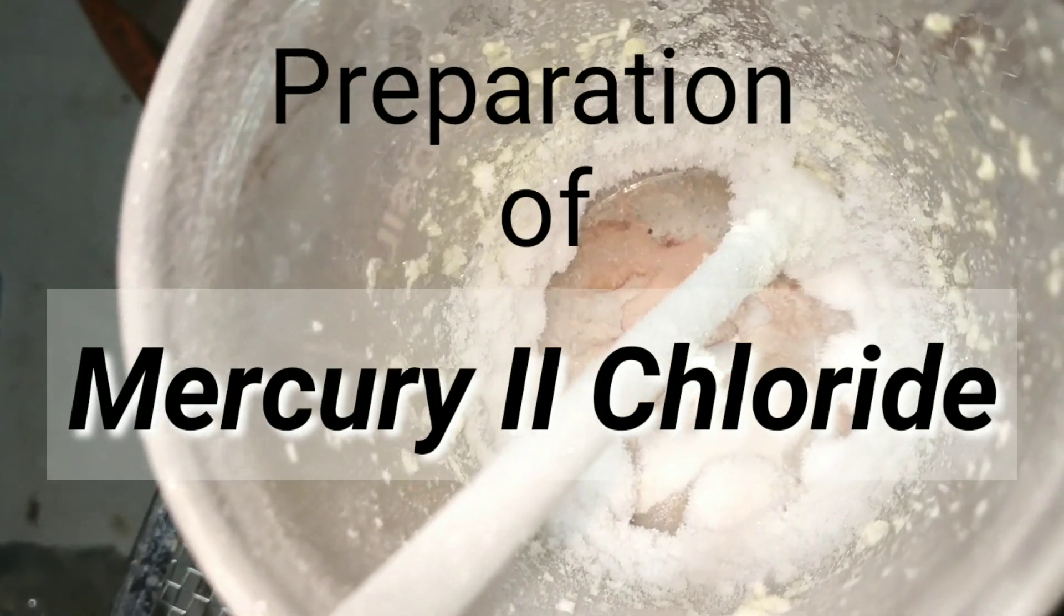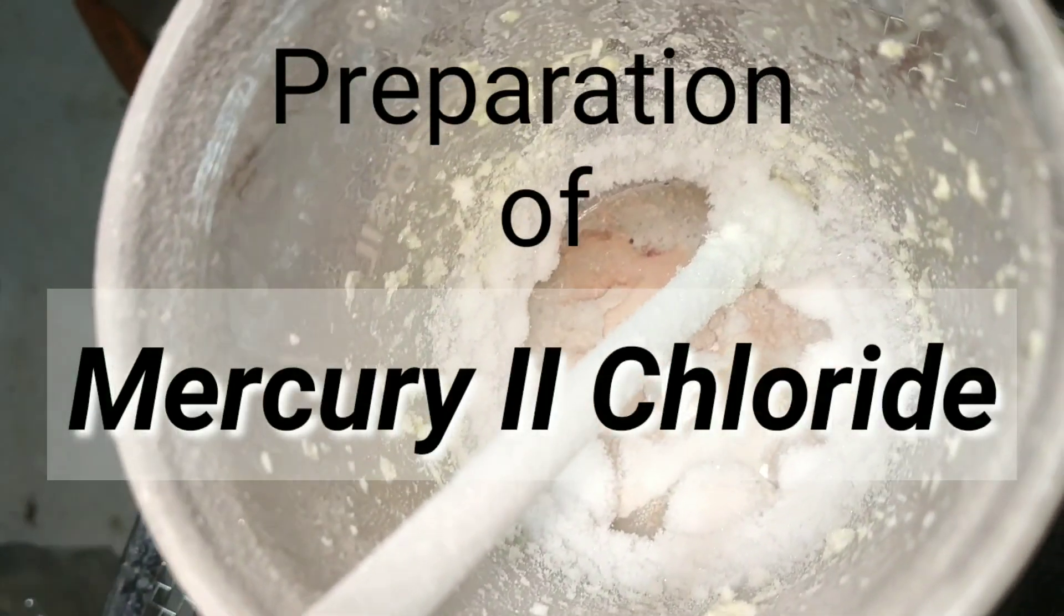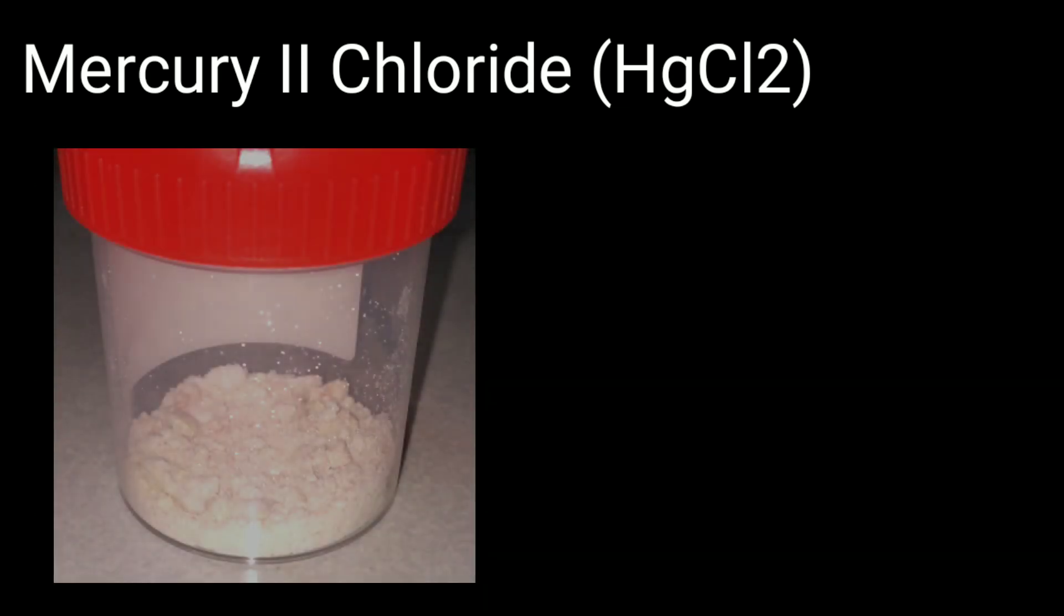Friends, today we will be making mercury chloride from mercury metal. Mercury chloride, also known as corrosive sublimate due to its tendency to sublime at higher temperatures, is an extremely toxic mercury compound which is also a very useful laboratory reagent and was earlier used in the treatment of syphilis.